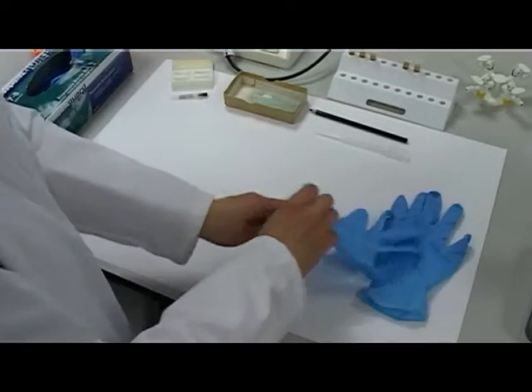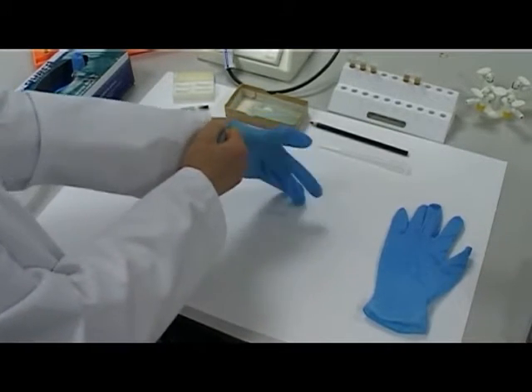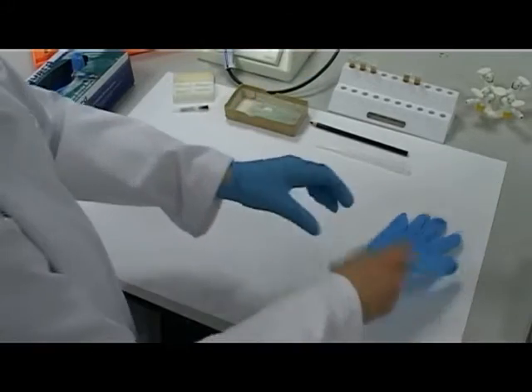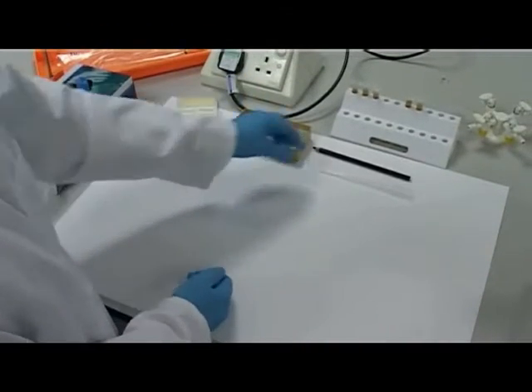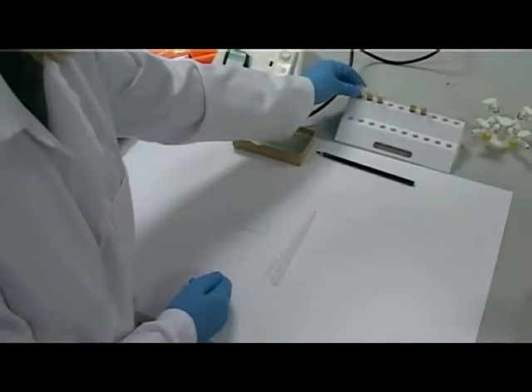Put on gloves. Select a microscope slide, select a pipette and select a urine sample.